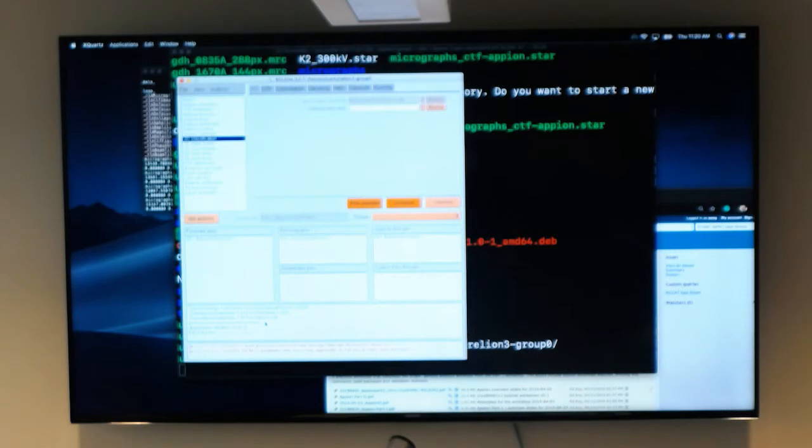Here's a mouse, here's some Swiss cheese. The mouse is going towards that cheese. And for you, it will take 5 minutes. Okay, so my instance is extremely slow. Everyone else's is really fast. It just takes like, and ours doesn't run at all. But yours doesn't run at all.